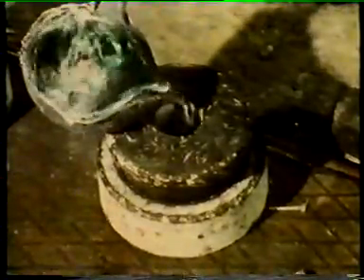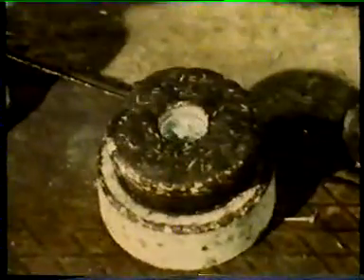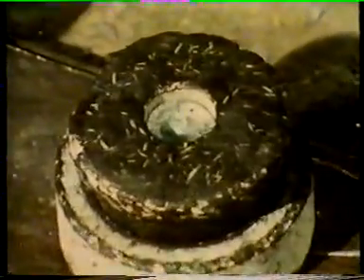From time to time, a small sample of the molten aluminium is taken for analysis. The metal is poured into a mold and left to solidify. Now we can see what happens as the aluminium solidifies in a special film. At a number of points in the liquid metal, tiny crystals begin to form and grow.